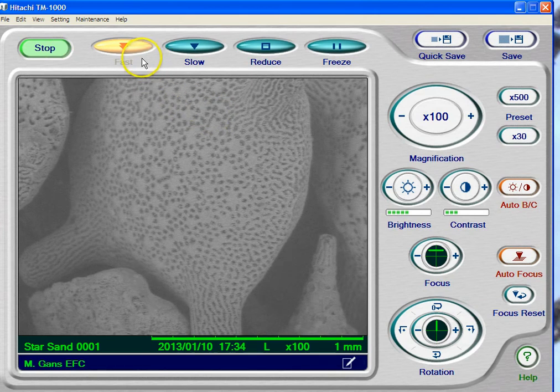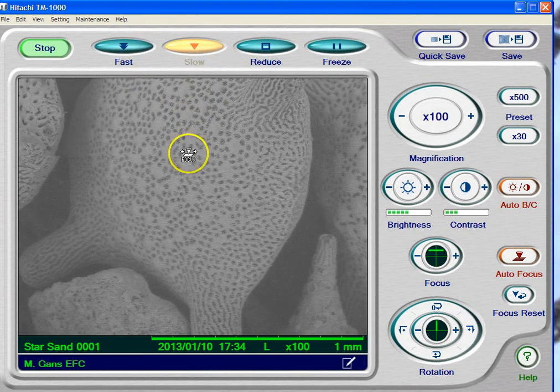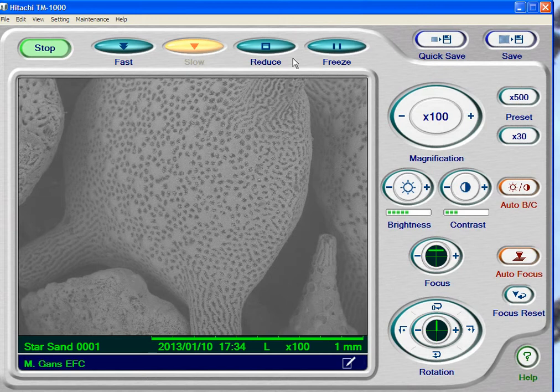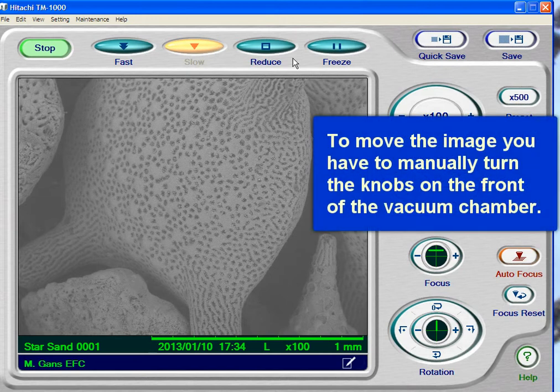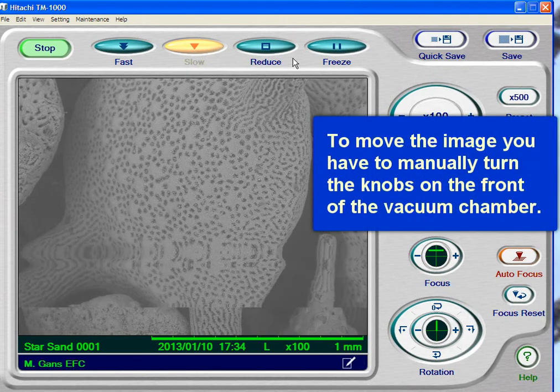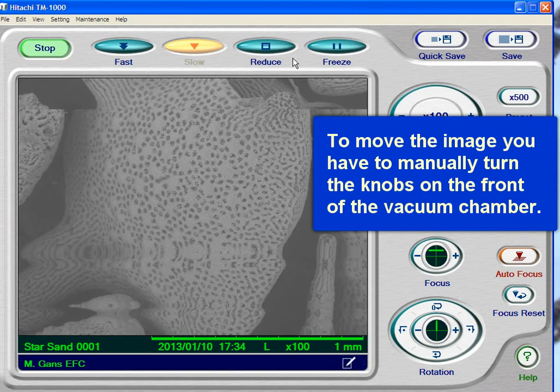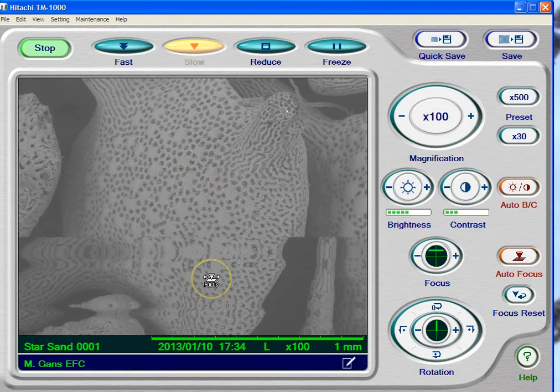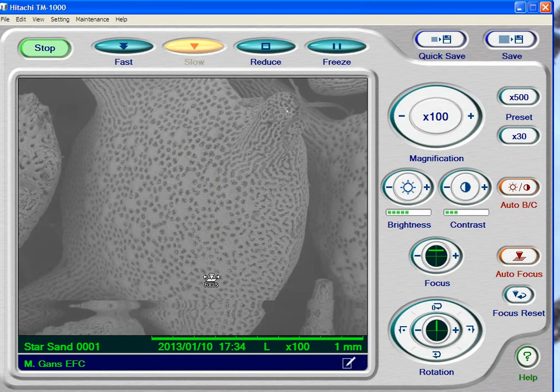A couple of buttons. We've got a fast button and a slow button — this is the scan speed. Let me go to slow so you can see what's going on. You can actually see this line moving down. This is a scanning electron microscope, and it actually scans left to right, line by line. The picture behind the line is new; the picture in front of the line is old. It's like a weather radar — it has a sweep past before you get new information.